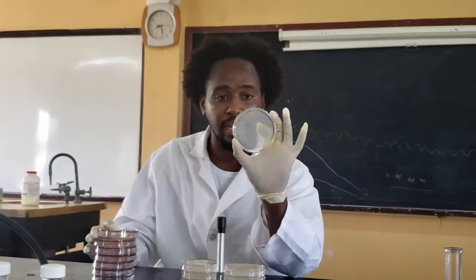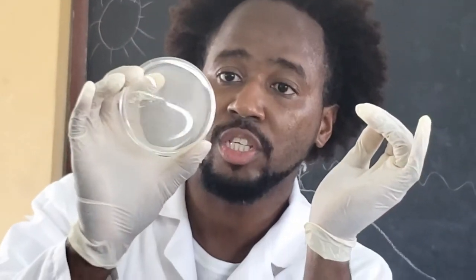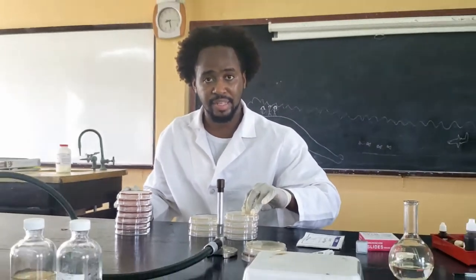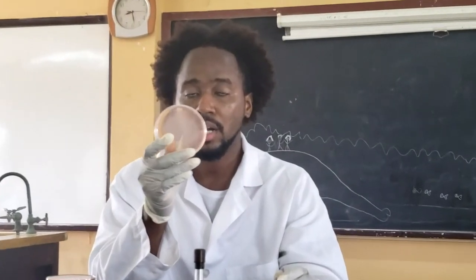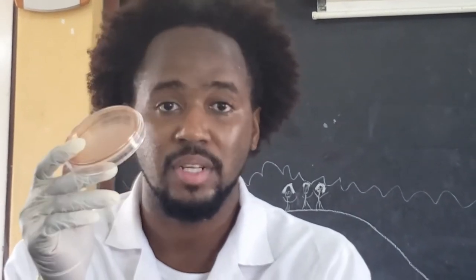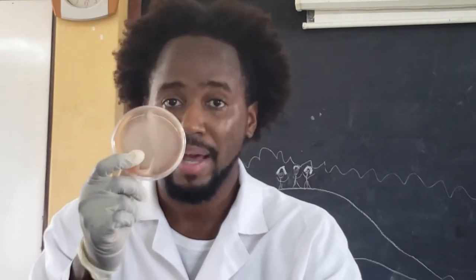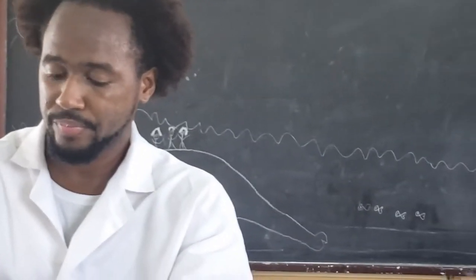The Luria broth agar is this more off-white to yellow color. That's just for general bacteria types. And then we're also using MacConkey agar. That one is more of a red-brown color. This one is what we normally use for some more severe types of bacteria like your Salmonella or your E. coli. Those types of bacteria commonly grow on MacConkey agar.